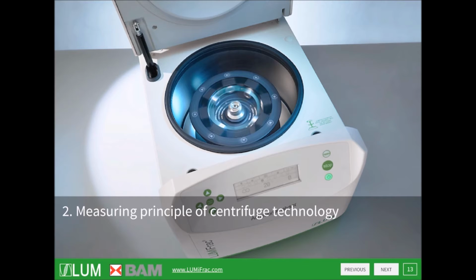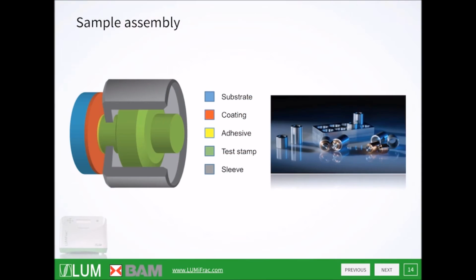Let's start with the preparation of the samples. What we normally have is the sample assembly, which consists of the substrate, the blue part, and the stem, and of course the adhesive.